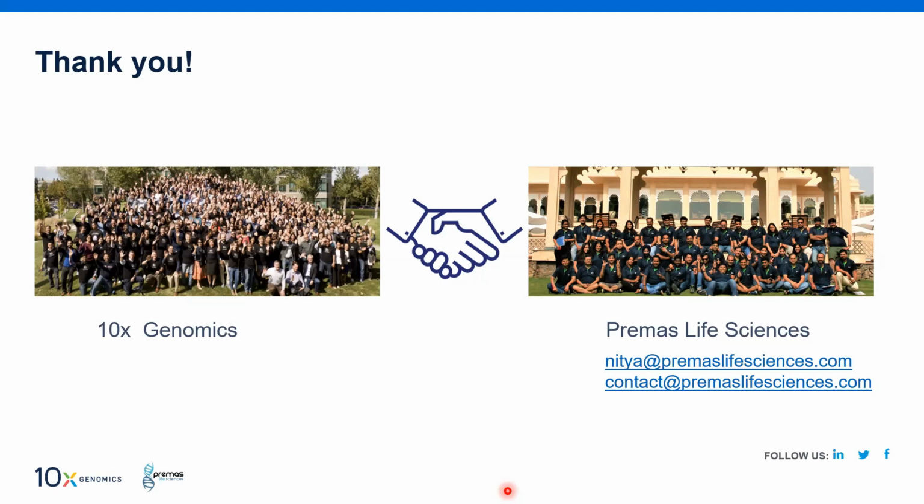Nitya, the next question is, people want to know the quantity. What minimum quantity in ml is needed to start the process? If you have 1,000 or 500 cells per microliter, then at least 50 microliters of sample will be sufficient, even 50 to 100 microliters. The number of cells is more important, because you can just spin down and enrich to make the stock concentrated.